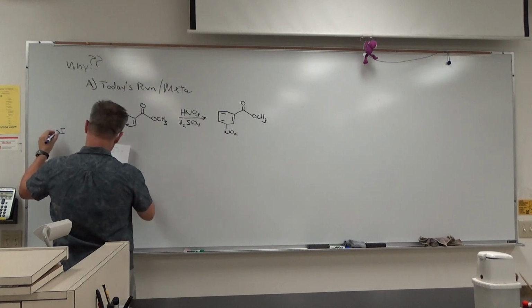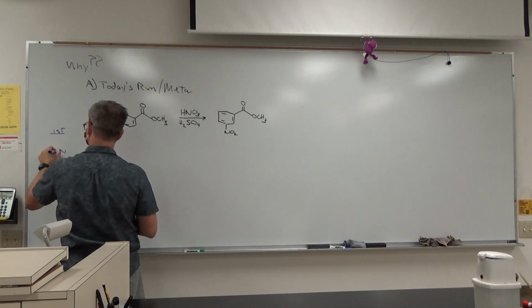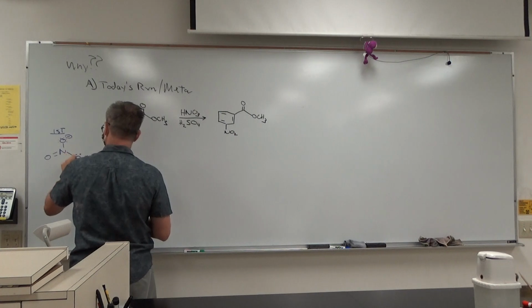First step is nitric acid. And there are different ways that you could draw this part.